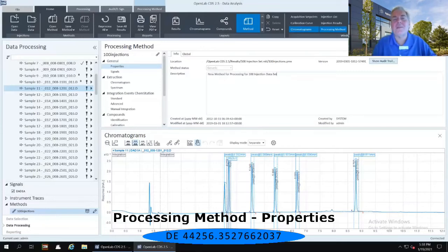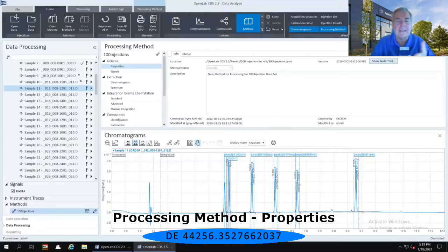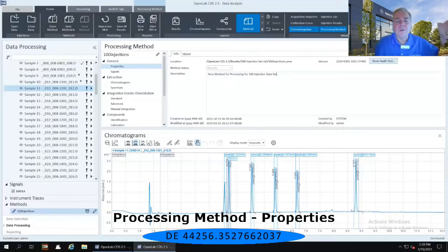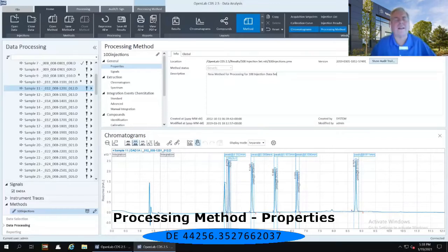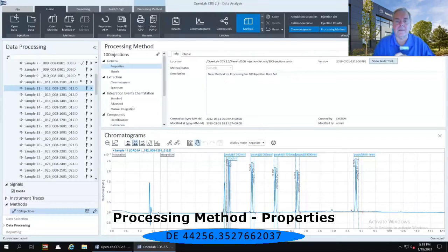Well, in OpenLab CDS data is simply data. So it doesn't matter what instrument it was run on. It could be an LC, a GC, an LC single quad mass spec or a GC single quad mass spec. Data is simply data. When you go into the data analysis portion of the software, it doesn't matter what instrument you had it run on. You are going to have access to all of the capabilities of being able to analyze this set of data.